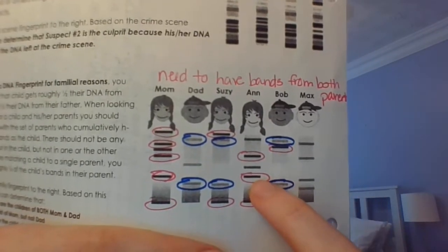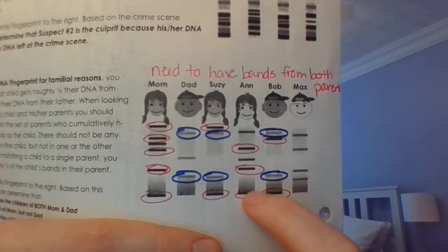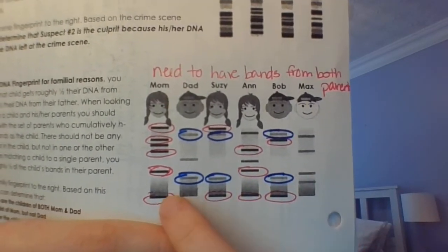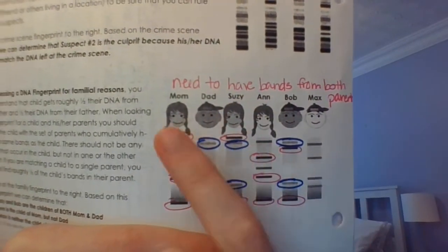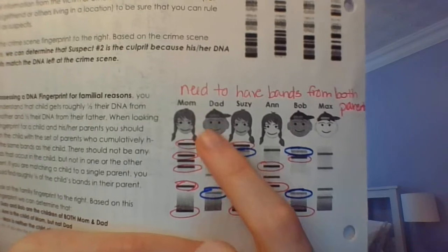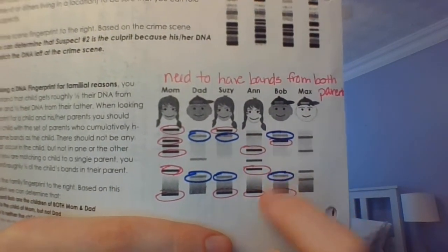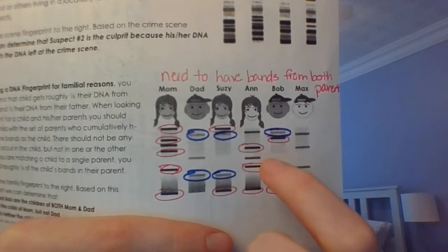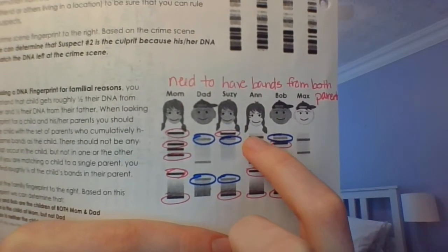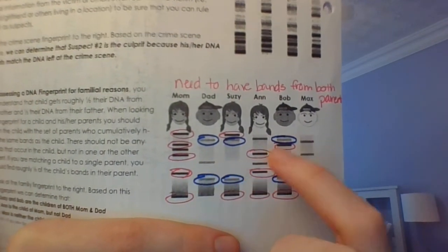Anne's fourth band is right here. Mom has a band right there, so that one's accounted for. And then her fifth band is right here. Mom has a band right there. Okay? So we can say that Anne is her child, but is not the dad's child because she does not have any of those bands from the dad, and she has bands that have been unaccounted for. No one has a band right here. No one has a band right here, telling you that there is another father.